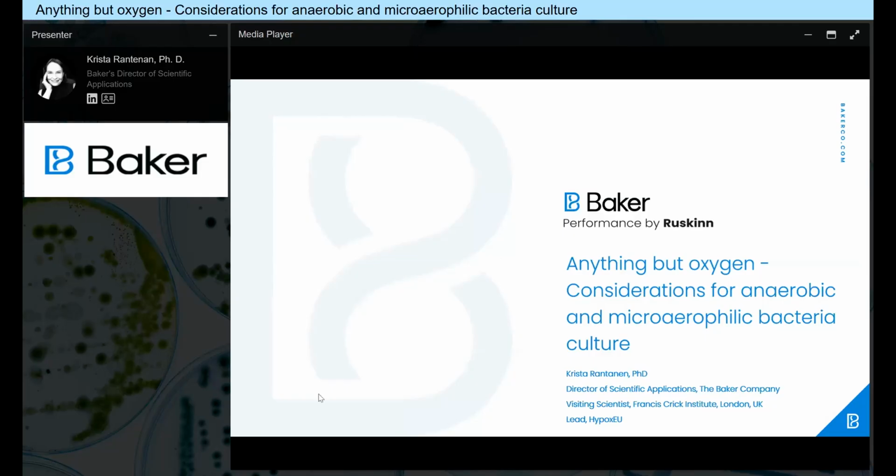Today's topic is anything but oxygen. So we're going to talk about what kind of considerations are needed when growing anaerobic and microaerophilic bacteria. And like I said, I'm Dr. Krista Rantanen, and I'm the Director of Scientific Applications here at the Baker Company. I'm also a visiting scientist at the Francis Crick Institute in London and the lead of Hypox EU, Community for Oxygen Biology.